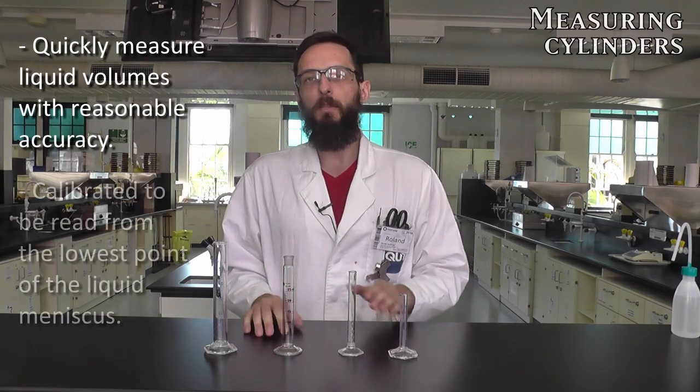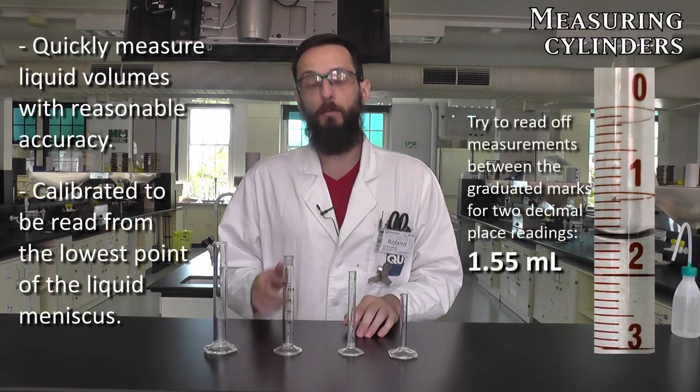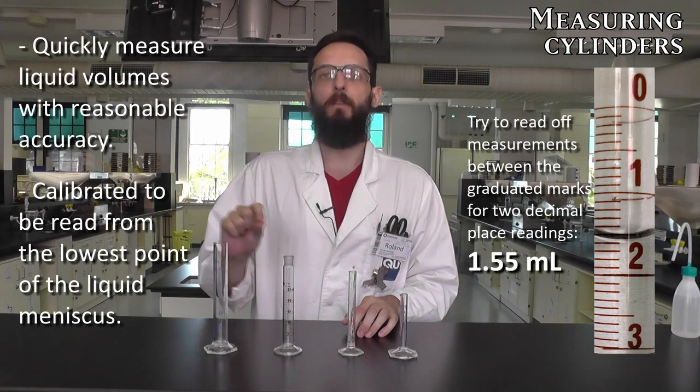Measuring cylinders are fairly straightforward. We use them to measure liquids with a reasonable degree of accuracy, and it's important when you're using them to measure from the bottom of the meniscus.